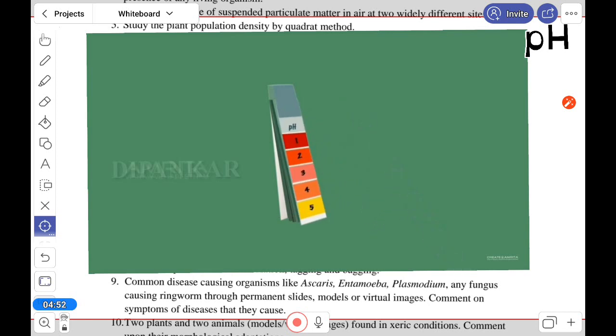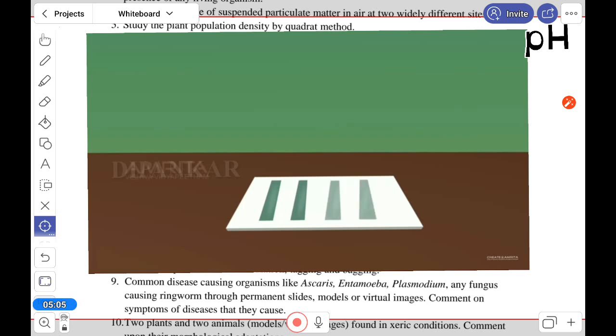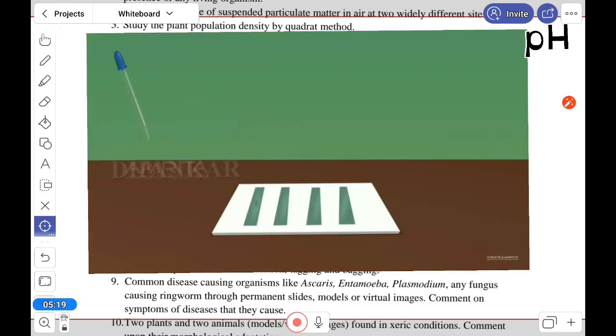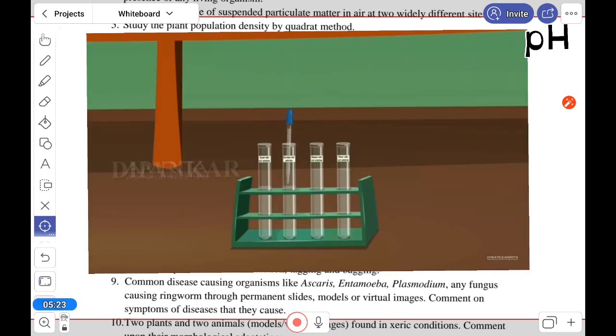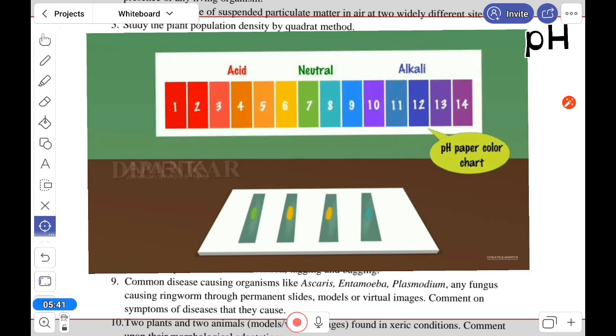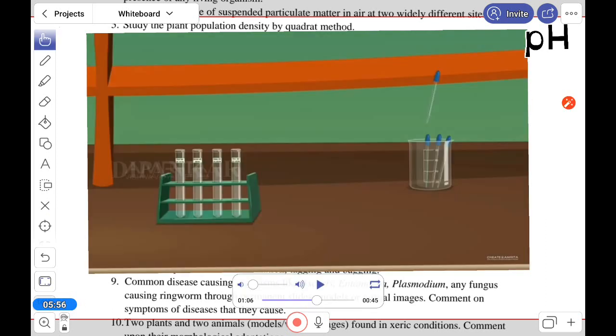Next, we use pH paper. Here we have 4 papers for the 4 samples. With the help of a dropper, the solution is taken and placed on the pH paper. We have to wait a few minutes for the color to appear. Then we check with the pH paper color chart that is given, and we can detect the approximate value.